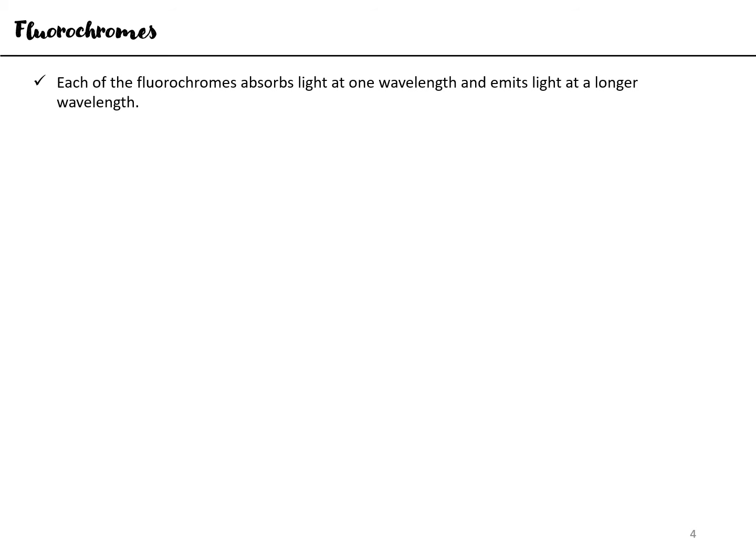So next we are going to discuss the different fluorochromes, and we'll be talking about some of the most commonly used fluorochromes. Each of the fluorochromes will absorb light at one wavelength and emit light at a longer wavelength. Now why will it emit light at a longer wavelength?